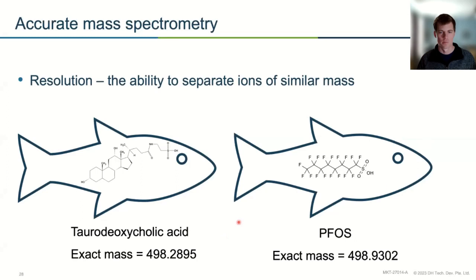If you look, I know it's probably small, but you have sulfate or sulfonate fragments on both of them. So they create similar fragments in triple quad analysis, and they have pretty similar chromatography. To separate these 2 can be a little tricky. It can make your run a little longer.